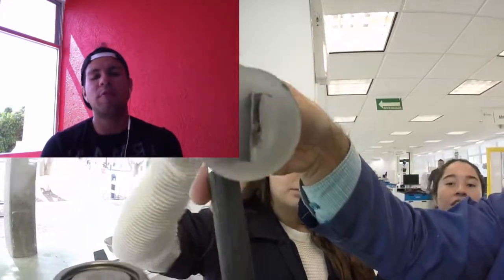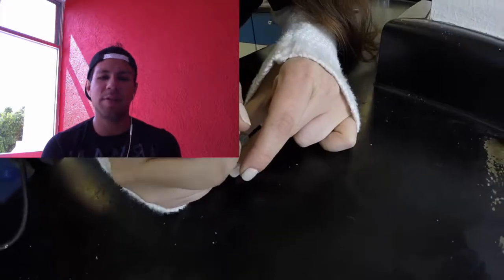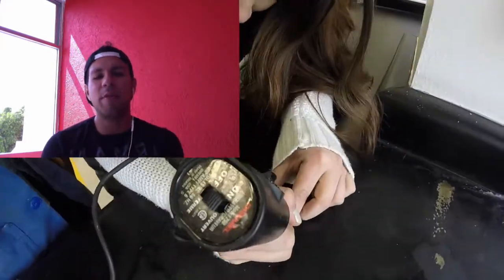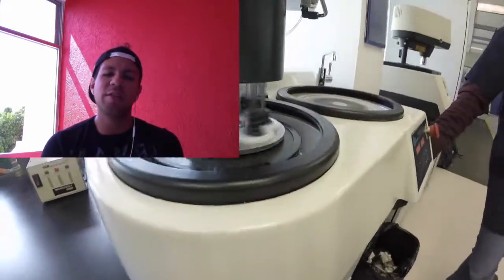They were sanded with a force of 18 pounds for 4 minutes at 200 revolutions per minute with the different sandpapers. Later they were polished with the alumina solution to give the finish that is needed.